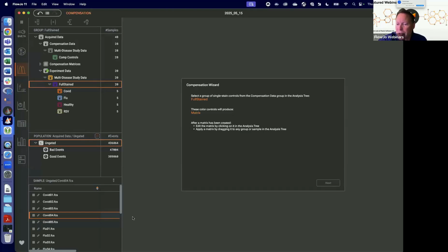Okay. How's the performance of FlowJo 11 running at a VDI? I assume that's something virtual. Can you give a recommendation addressing the hardware for workstations and also server-based user workarounds, VDI? So there we go, we got an explanation there. Performance is good. Everything that I'm doing here, I'm doing on the entire experiment. I don't know if you're thinking, well, this looks about the same. We're also working at the entire experiment level all the time. It's one of the reasons we wrote a whole new version: we wanted to increase performance.